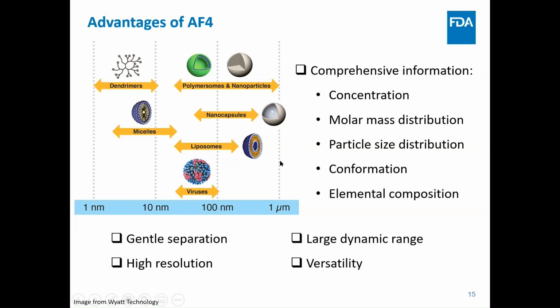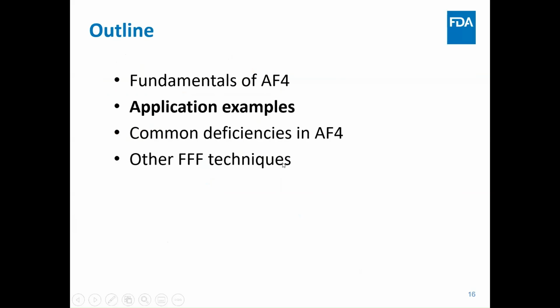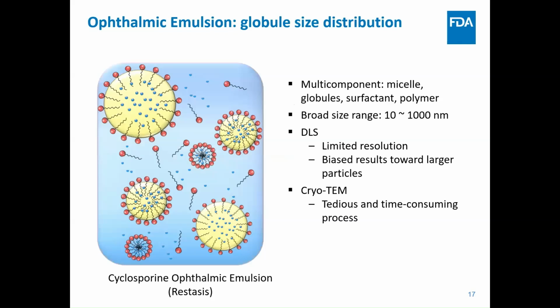And what is the composition of particles? So next, I'm going to use a series of examples to show you the capability of this AF4 and what information you can obtain from this technique. The first example is ophthalmic emulsion.